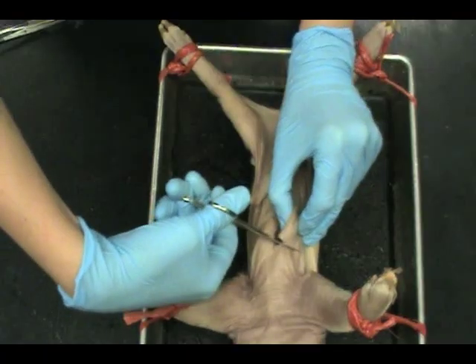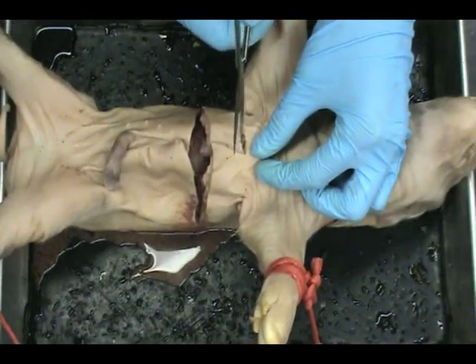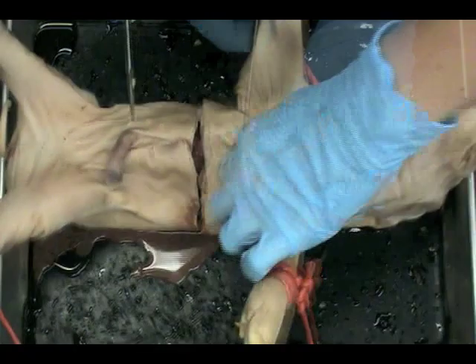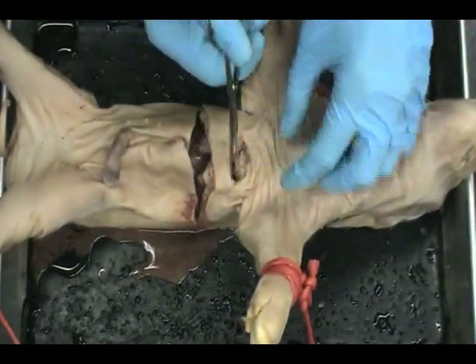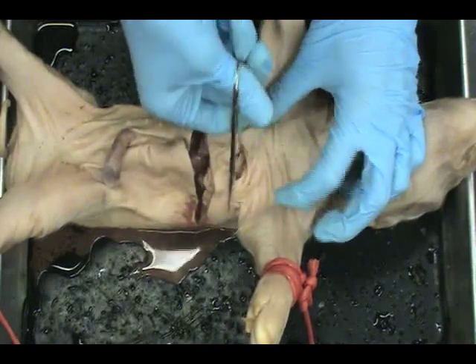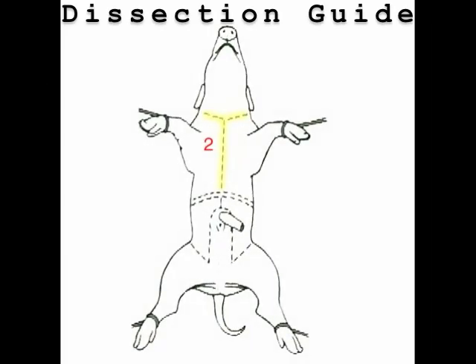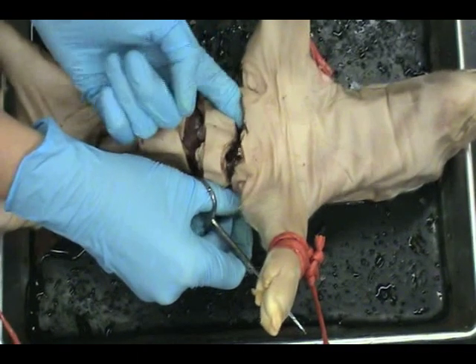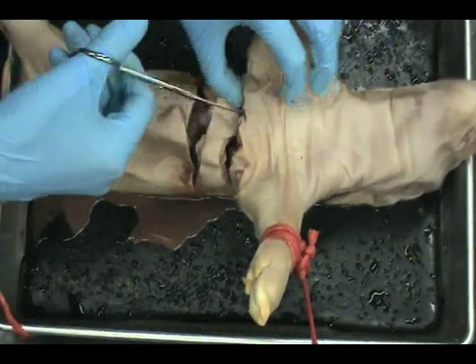Cut along both sides of the diaphragm. Use your finger to push back the connective tissue in the chest cavity.